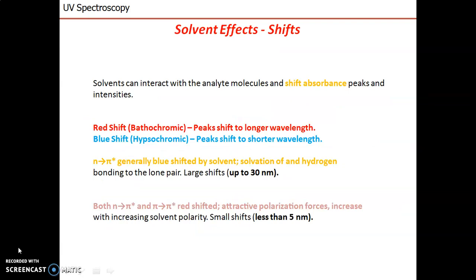Then next is the solvent effect. Solvent effect means, if paracetamol is a compound and we are dissolving it in four different types of solvents. Suppose paracetamol is dissolved in water, paracetamol is dissolved in HCl, paracetamol is dissolved in dilute NaOH solution, or paracetamol is dissolved in water which contains a little bit of HCl. So what changes are we observing? If paracetamol has more solubility in NaOH, it shows absorption at 257 nanometer.